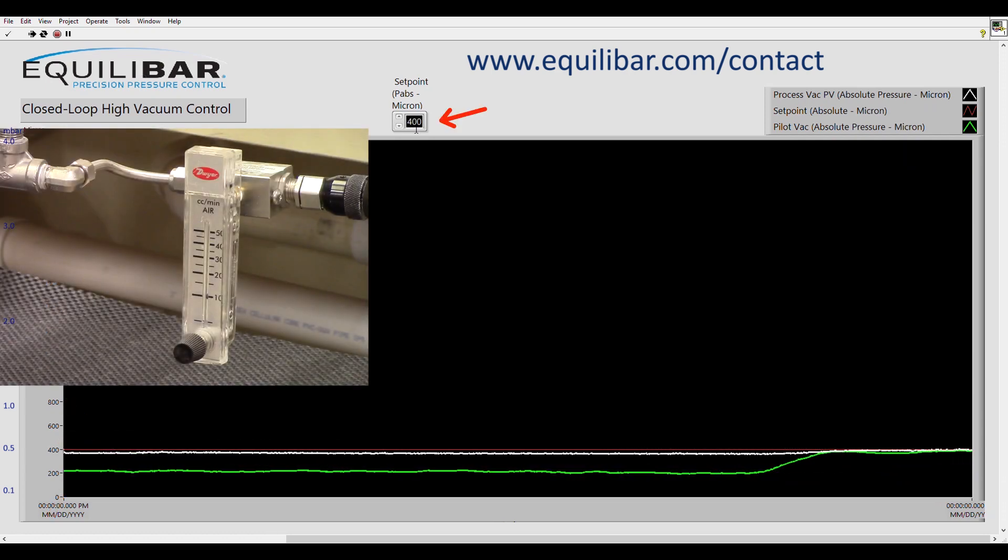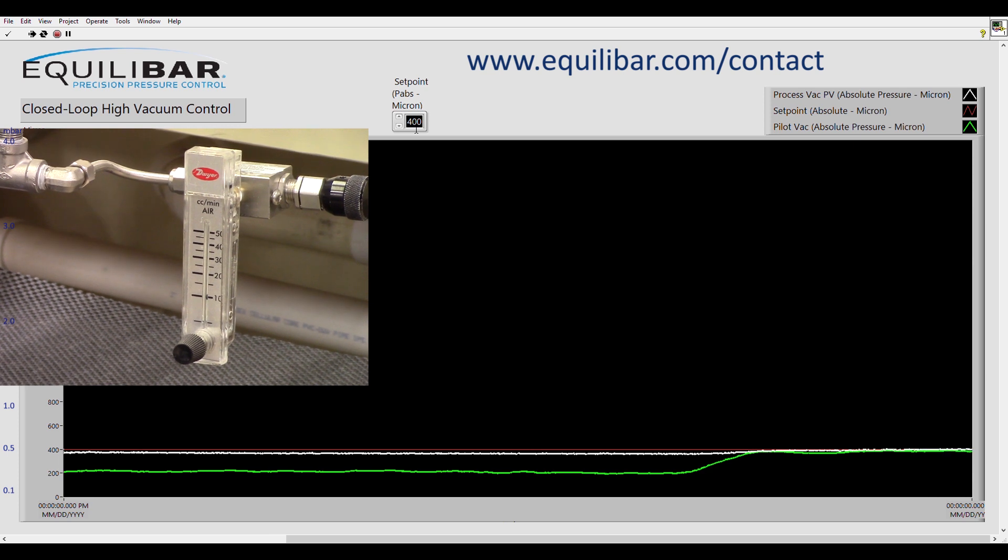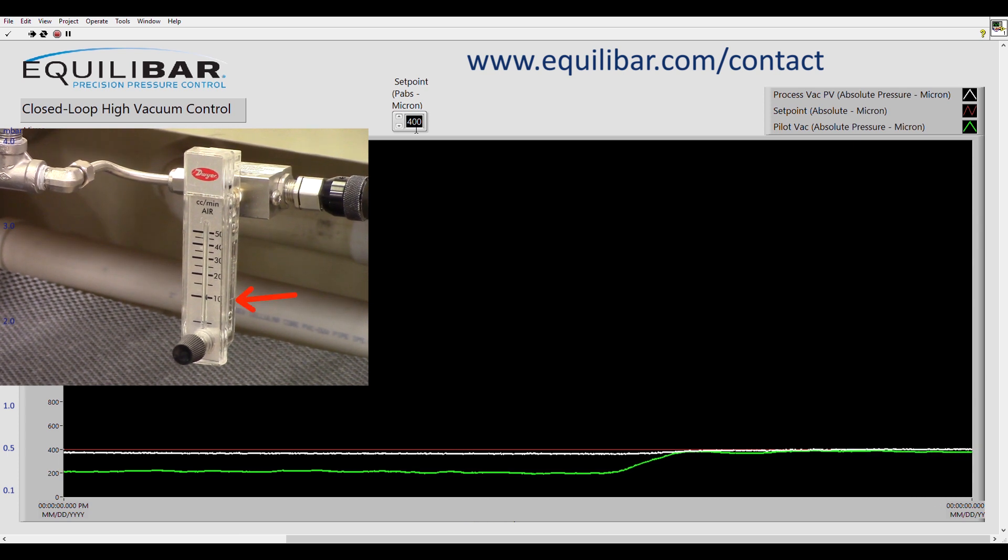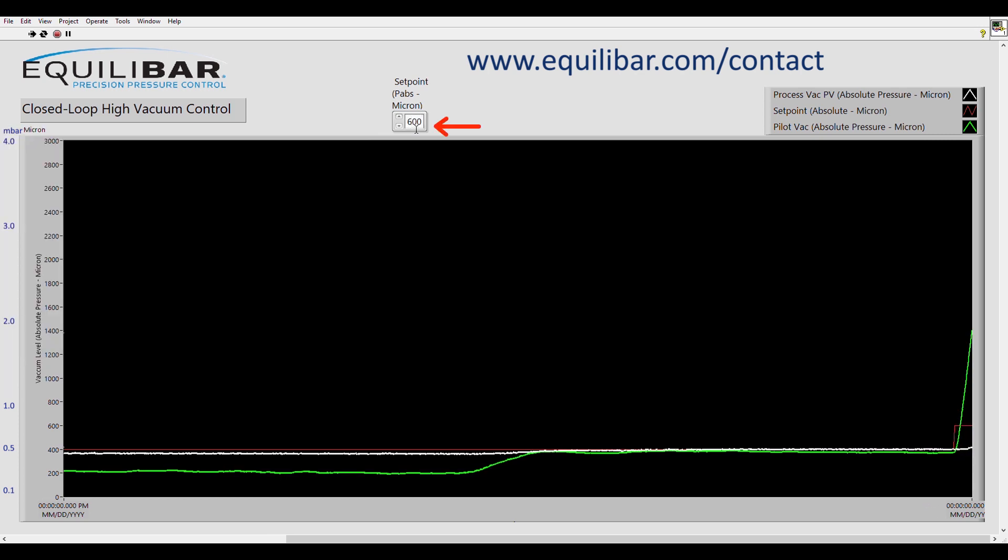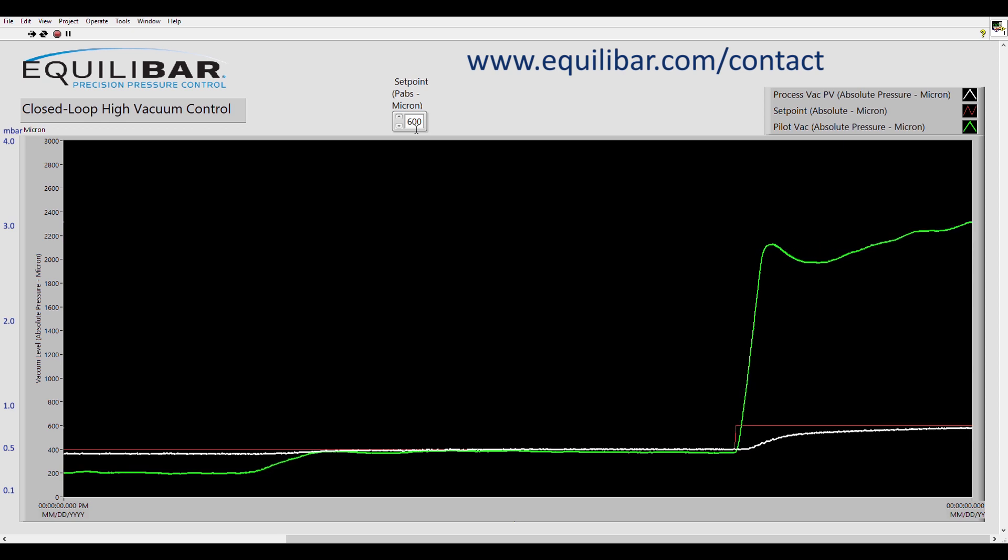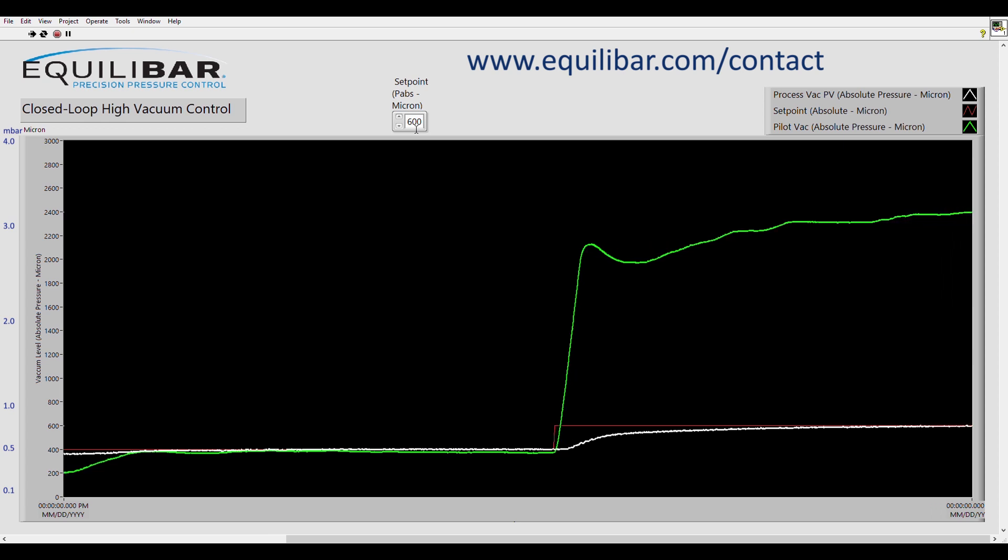Now we're controlling at 400 microns with about 10 standard milliliters a minute of mass flow. Let's see the effect of changing the set point from 400 to 600 micron. Note that the PID controller adjusts the green pilot pressure to bring the white process pressure line back to the set point.